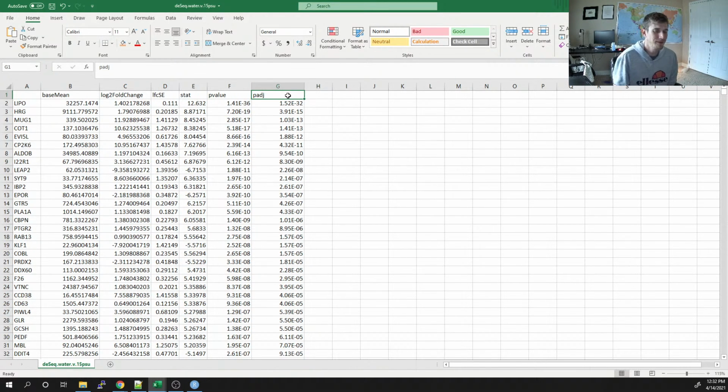There's a handful of ways to do this, but it's effectively kind of like lowering the threshold of significance. So instead of saying P 0.05 is going to be a significant result, let's say P 0.001 is actually a significant result given how many tests we've actually done. It's not exactly what's happening, but it's kind of what's happening. It's just an adjusted p-value to correct for differences that appear different although it's just random noise. So we care way more about the adjusted p-value than we do the actual p-value.